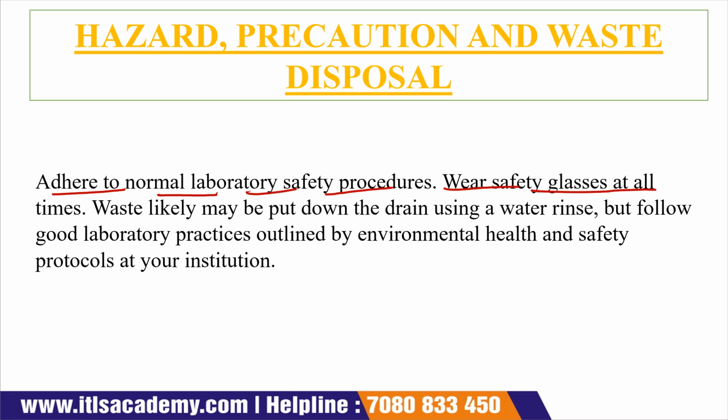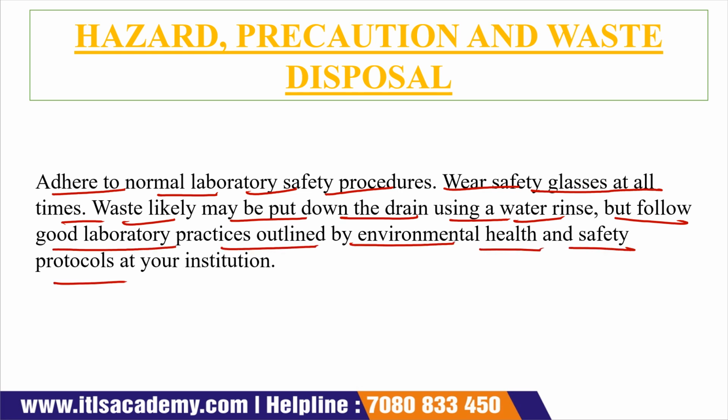Wear our safety glasses at all times. Waste may likely be put down the drain using a water rinse, but follow good laboratory practices outlined by the environmental health and safety protocol at your institution.